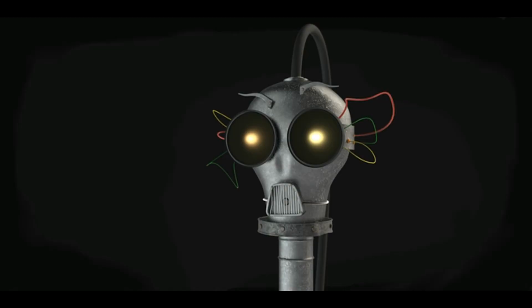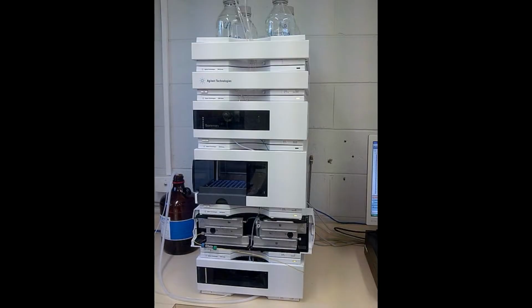This summarizes the two primary human senses that relate to analytical lab equipment and the machine senses. The first of the lab-based equipment is the HPLC-MS, or high-pressure liquid chromatography mass spectroscopy. Compare the two senses discussed so far with the following equipment.